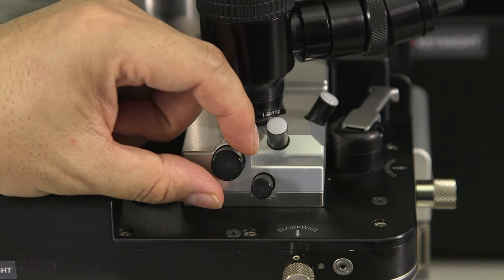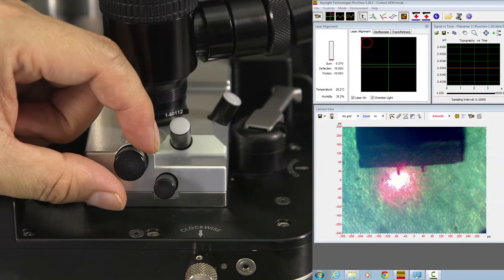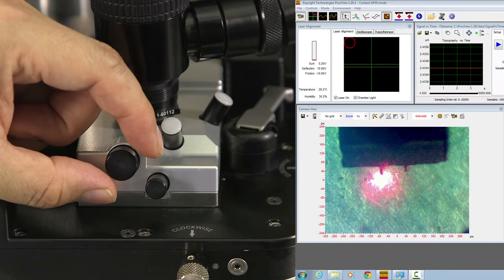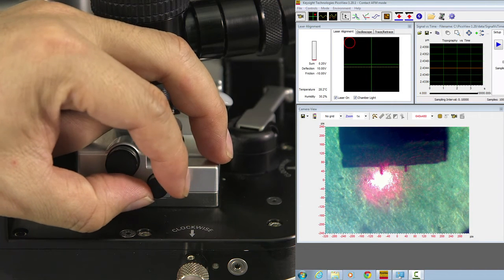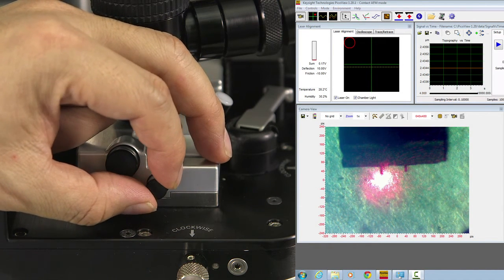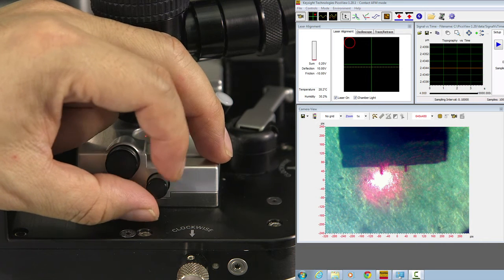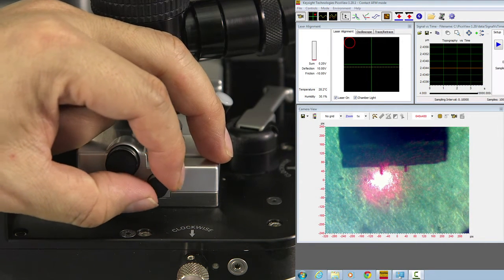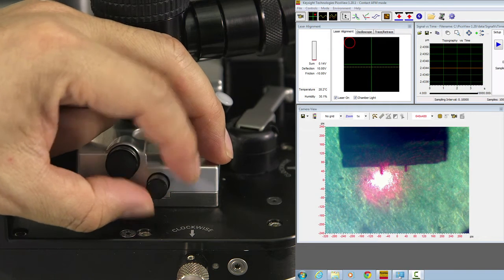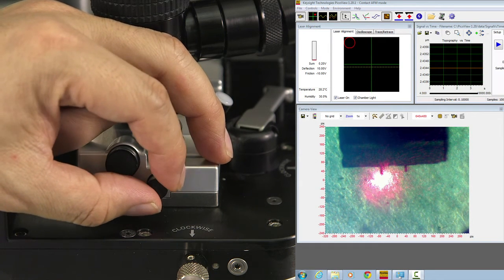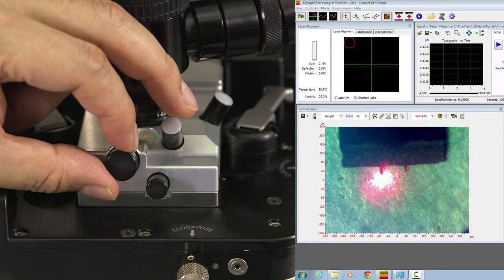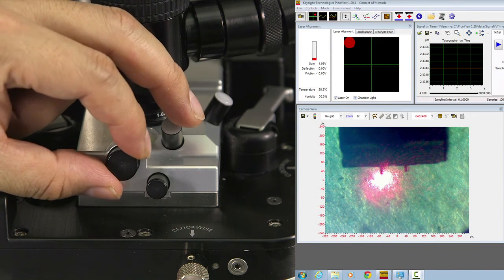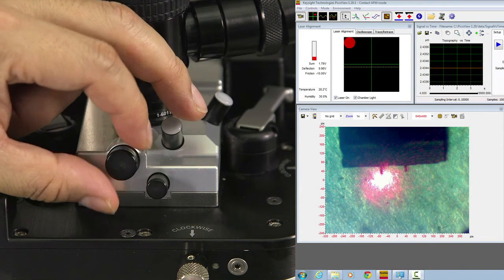Now, let's look at the computer screen, the laser spot. First, we move the small knob left and right, and don't look at the laser spot, the red dot. Look at the sum signal. You should move the knob so the sum signal goes higher until it maximizes. And then you adjust the other knob also towards the direction that the sum signal goes to maximize.